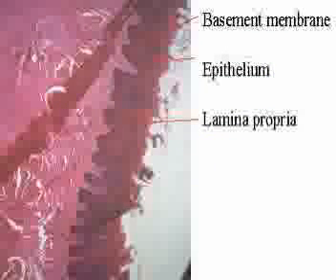Squamous epithelium. A stratified epithelium is one with more than one cell thickness on basement membrane. In this case, the epithelium is mainly multiple layers thick. Its cells are also flat and polyhedral, suggesting they are squamous cells. Hence, the epithelium is stratified squamous epithelium. The basement membrane is clearly visible as darkly staining in the basal part of the epithelium.